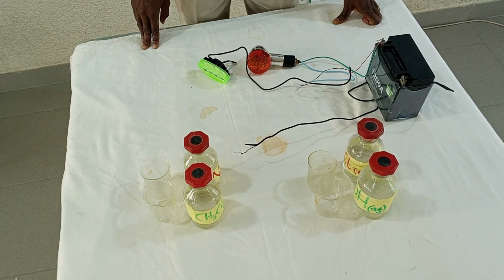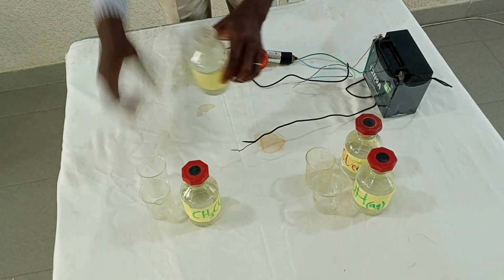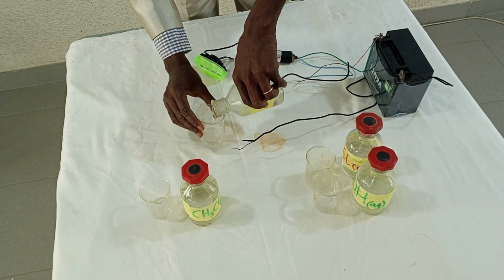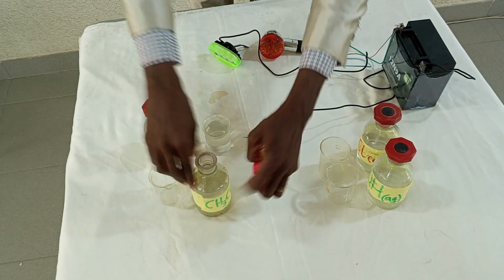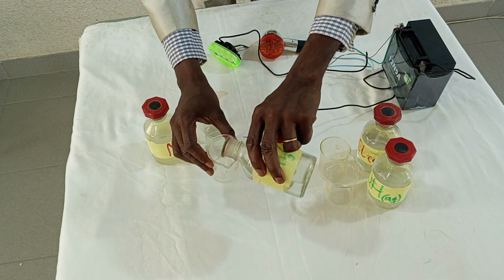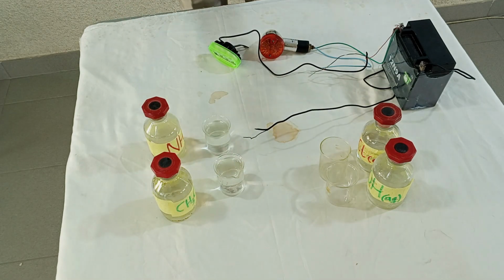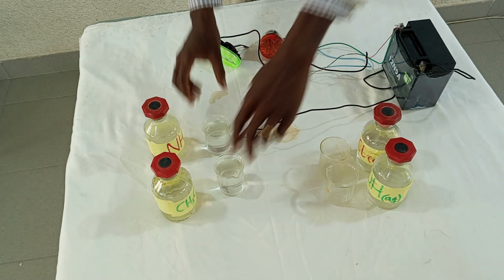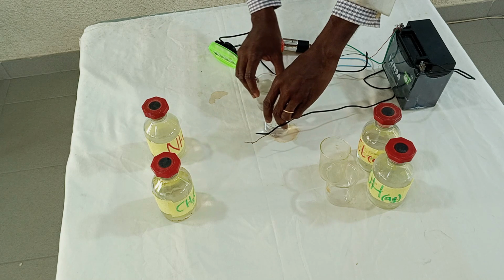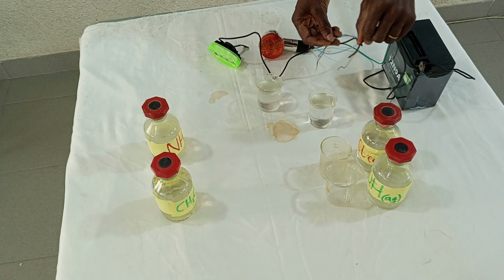I'm going to start with the ethanoic acid and the ammonia. I'm going to pour a sample of the ammonia solution into my beaker, and another sample of the ethanoic acid into my beaker. Ethanoic acid is a weak acid and ammonia is a weak base. Now let's see in a demonstration. I'm connecting my battery into the solution.